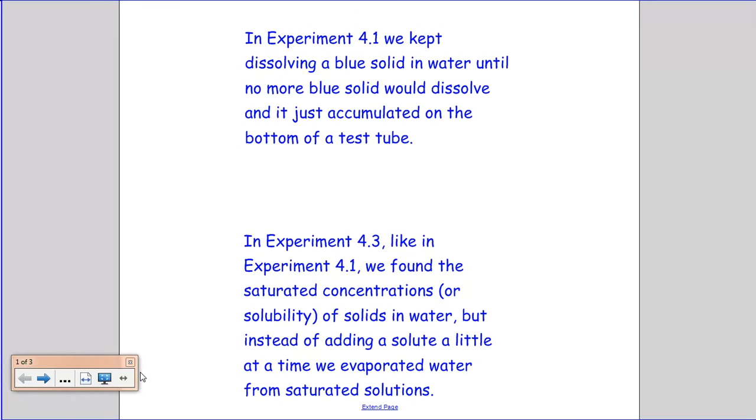In experiment 4.1, we kept dissolving a blue solid in water until no more blue solid would dissolve and it just accumulated on the bottom of a test tube. If you remember, we made an estimate as to the saturated concentration of that blue solid in water. If we wanted to be as precise as possible, we would have redone the experiment several times and honed in on the exact amount of blue solid we could add to water.